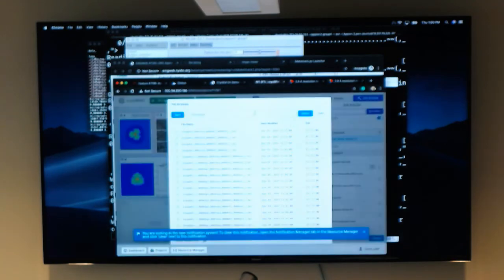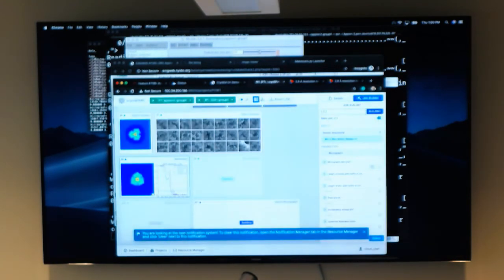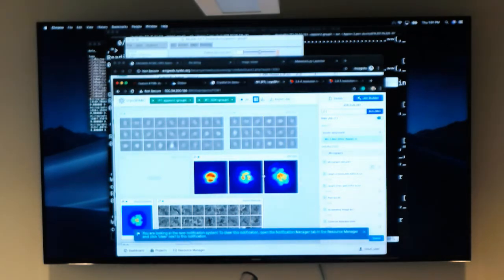But I would first recommend that you try the GDH just to make sure that you understand all these parameters and get that to work. And we'll give you some more time. In about half an hour, I'm going to go over a review of certain outputs, very similar to Relion, and then we'll just give you more time to try out both programs.